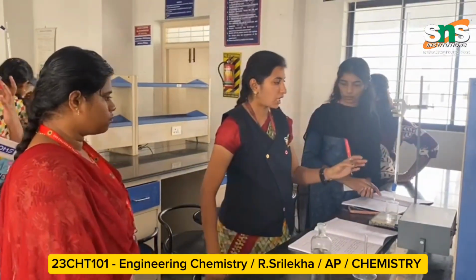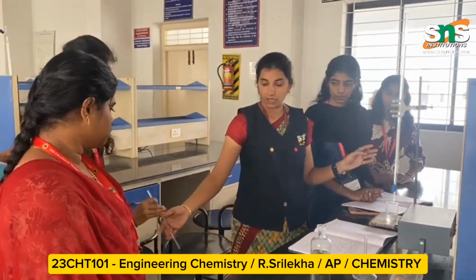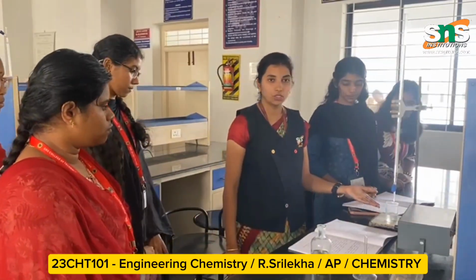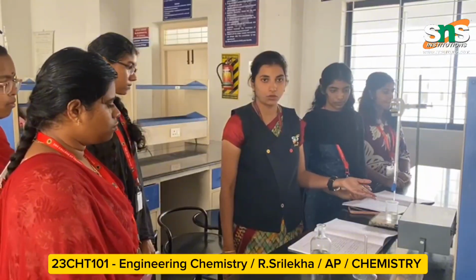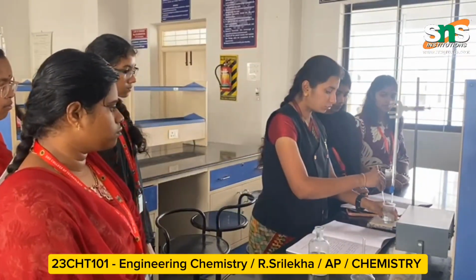So with this I am starting with the burette solution of NaOH and 20 ml of the mixture of acids diluted with 20 ml of distilled water. So this is the solution setup for the reaction.